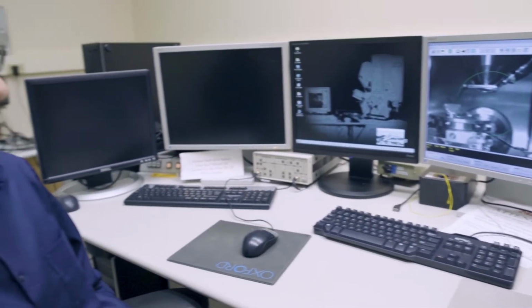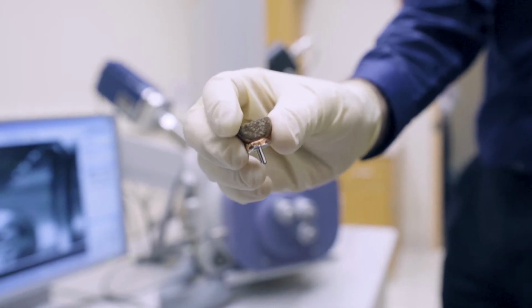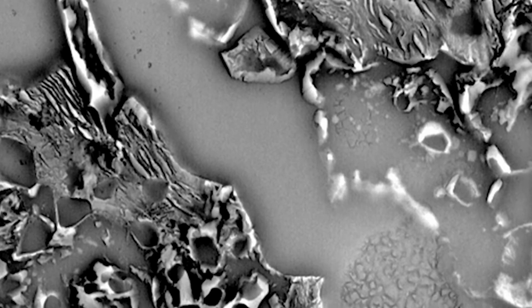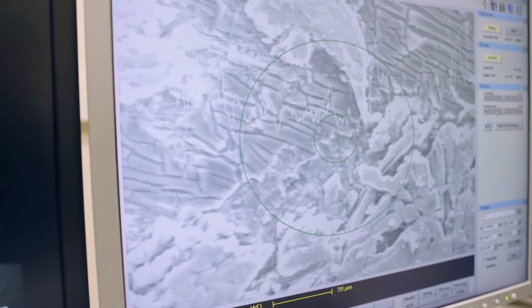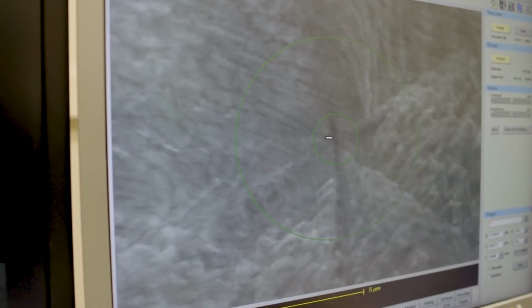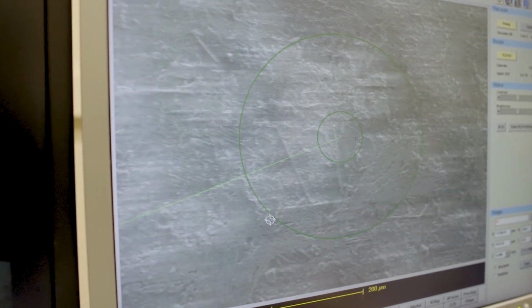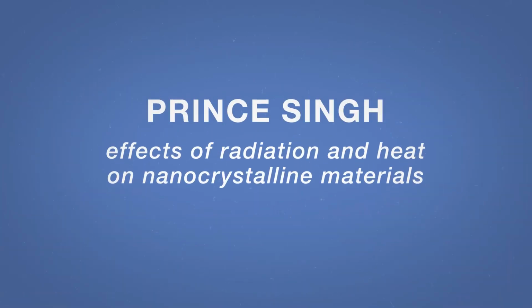First project is by my PhD student Matthew Hecht in material science and engineering, and he's utilizing electron microscopy to look at carbide particles in ultra-high carbon steels. These are a class of steels that are very hard, very robust for forming and shaping of other softer metals, including other steels. Carbide particles are a critical component of the microstructure in these steels, and he's utilizing statistical analysis of hundreds of micrographs to look at particle size and evolution as a function of different processing / heat treatment conditions, and relate those effects to the mechanical properties of the steel.